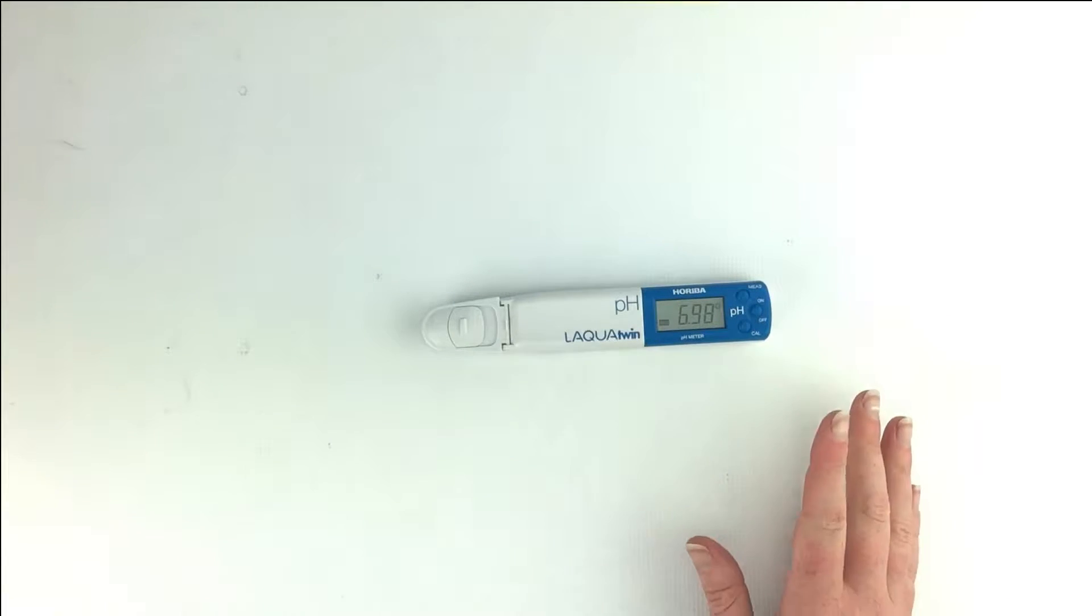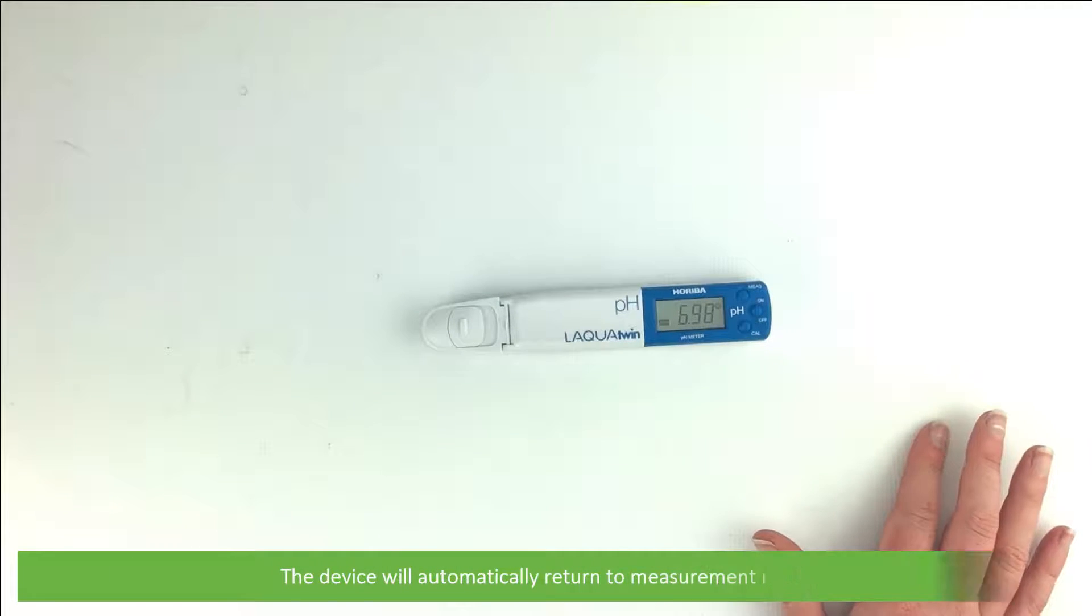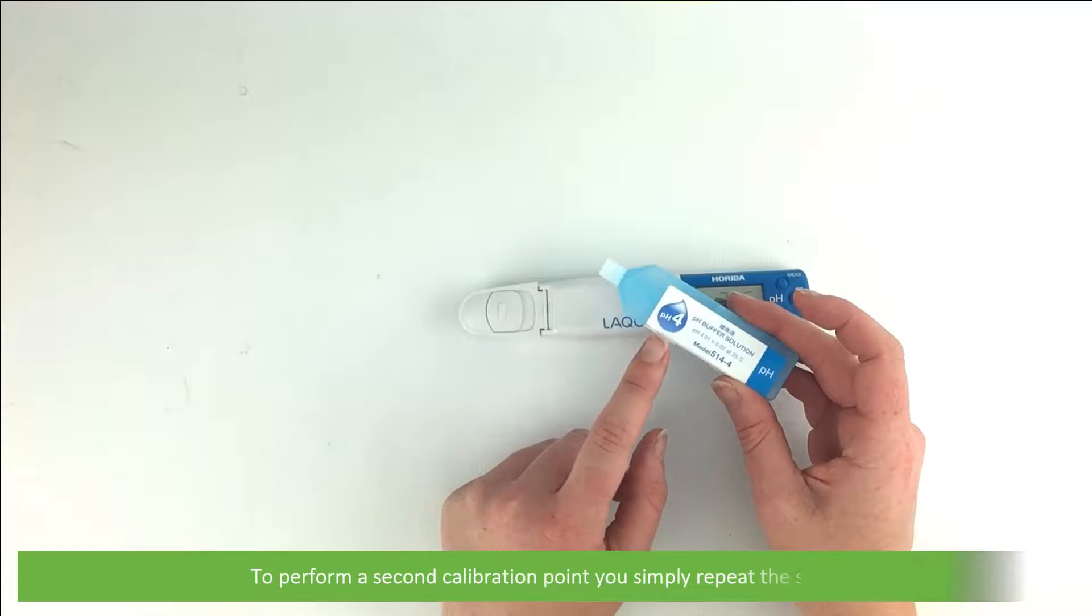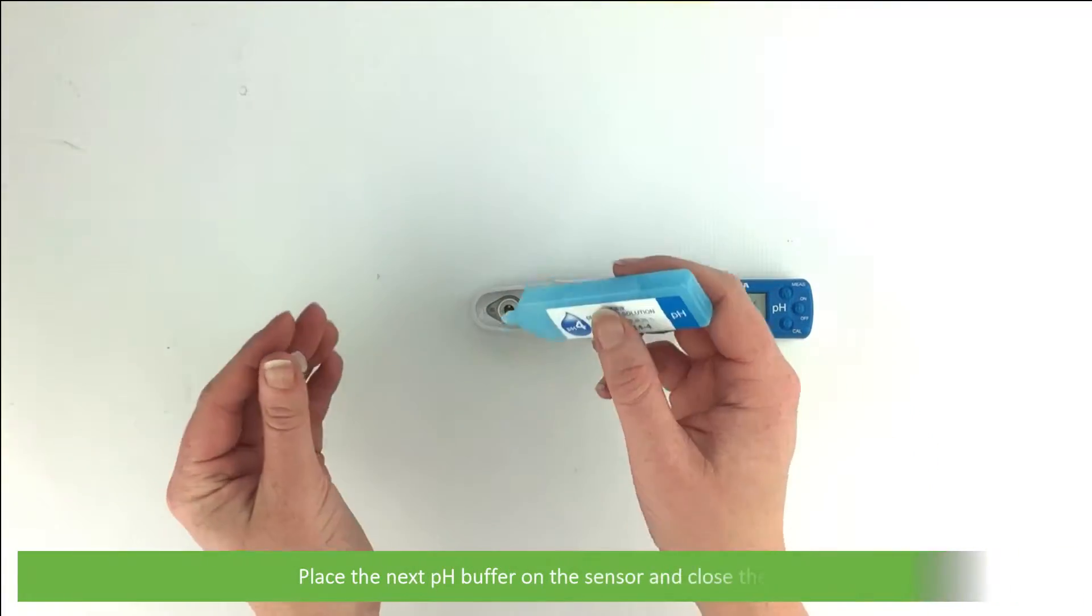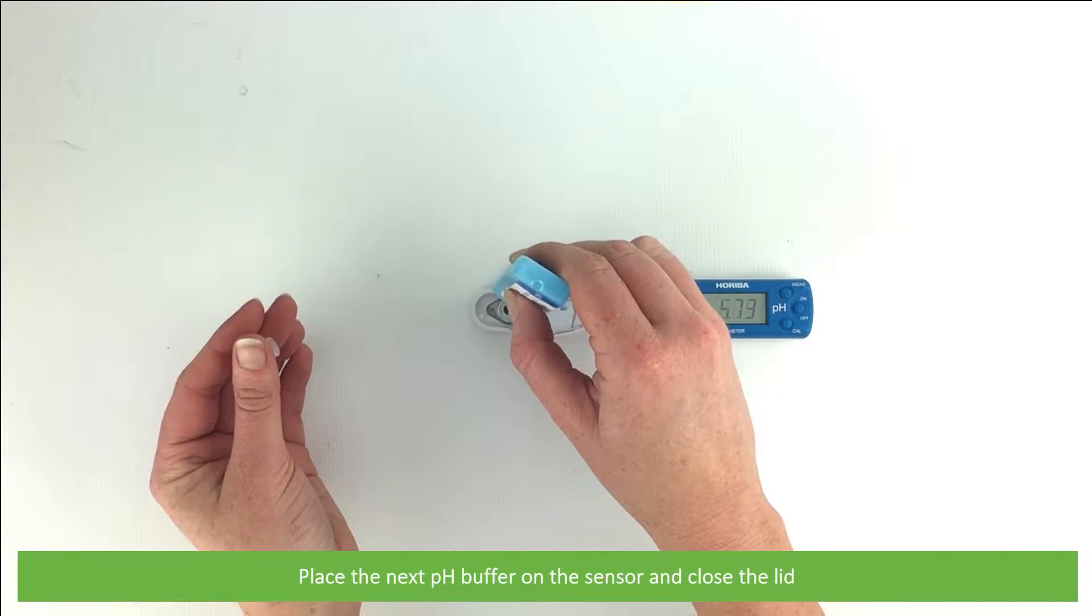Then the device will automatically return to measurement mode. To perform a second calibration point, you simply repeat these steps. Place the next pH buffer on the sensor, then close the lid.